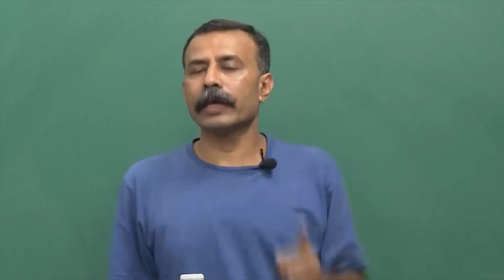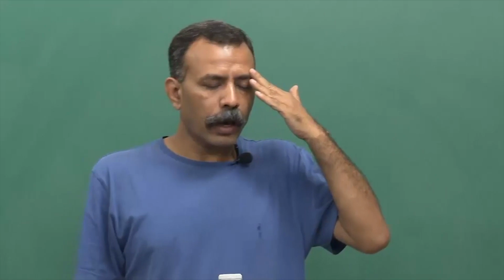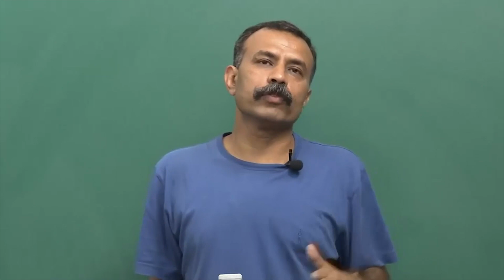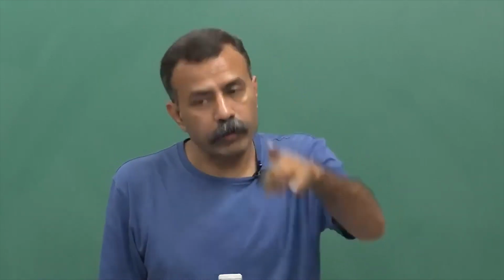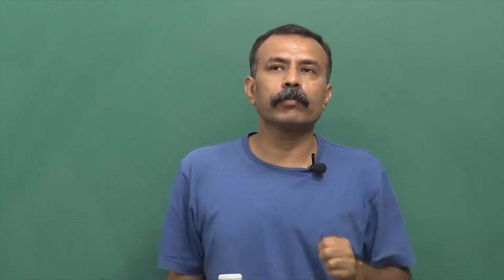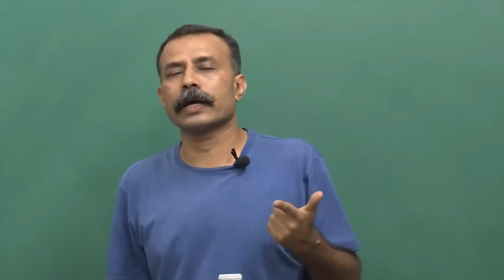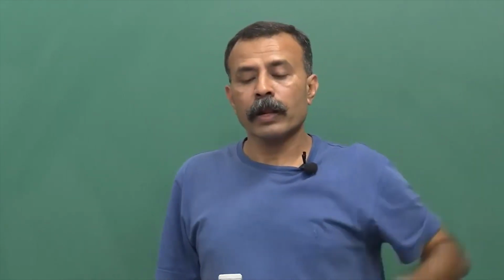They will not take into account what problems you are going to face. Either you have to be upfront and very clear that this is the kind of sample I have to visualize, and you convey that to them, or you explore it by yourself, because this is a pertinent problem I have seen over the years when we have set up labs. One negligence on our side cost us very dearly. Why did we do it like that? We should have done it the other way.